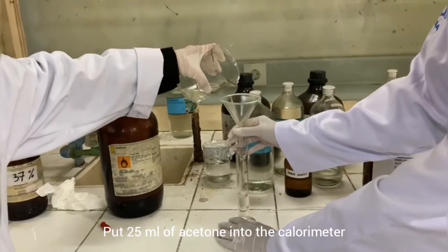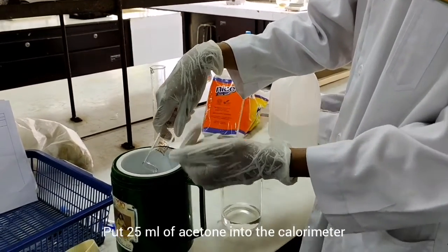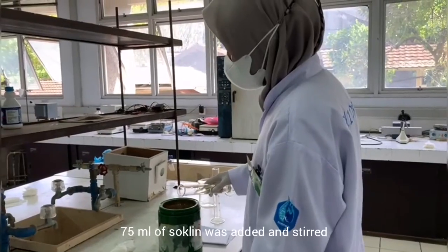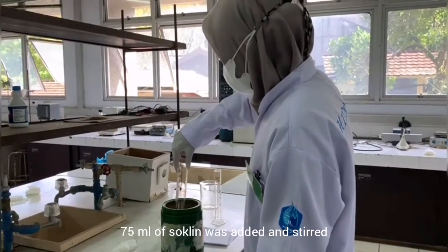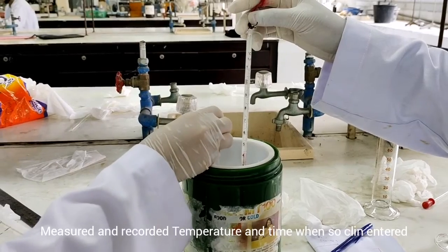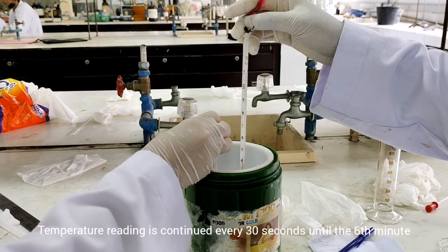The third experiment carried out was the heat of reaction. First, put 25 ml of acetone into the calorimeter. And then 75 ml of bleach was added and stirred into the calorimeter. Then we measured and recorded the temperature and time when the bleach entered. Temperature reading is continued every 30 seconds until the 6 minutes.